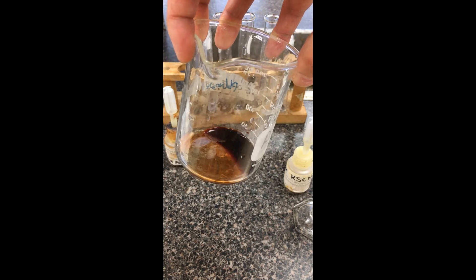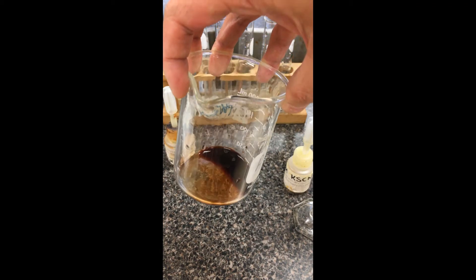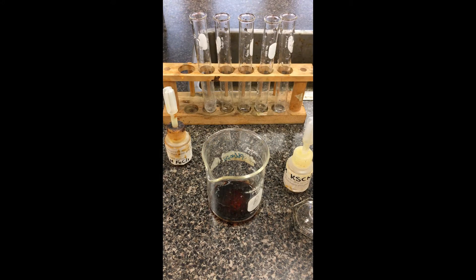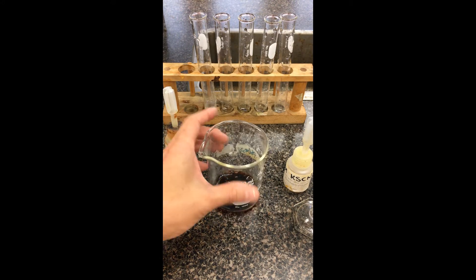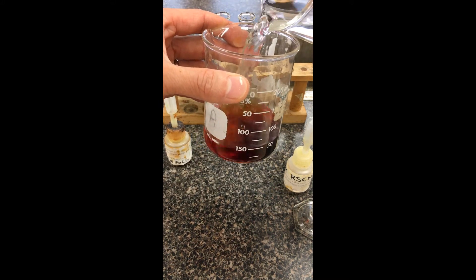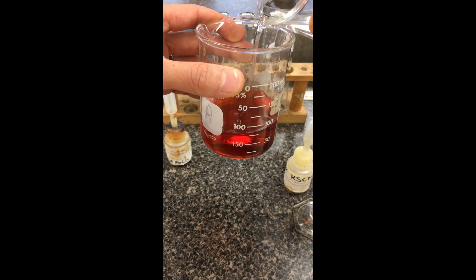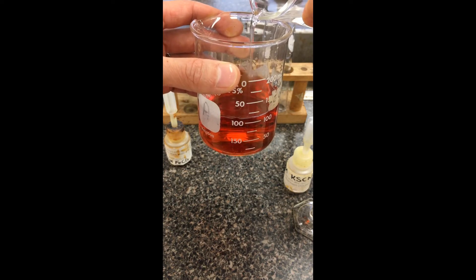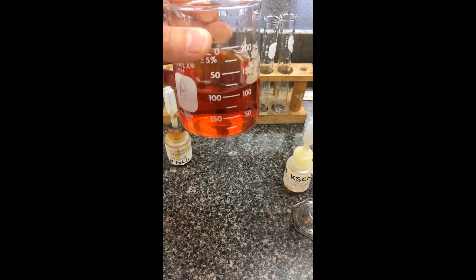We're going to steadily, via different dropper bottles, shift the equilibrium. We're going to monitor what happens to the color change to figure out whether it's shifted left or right. I'm going to add a little bit of water to dilute this — color intensity responds depending on total volume. I'm going to try to get it to what they call a light amber color, maybe a yellowy-orange tone.